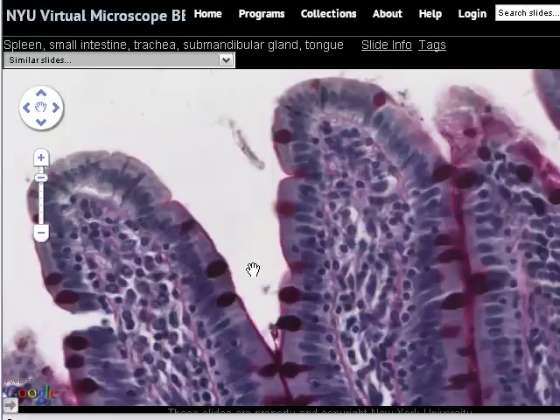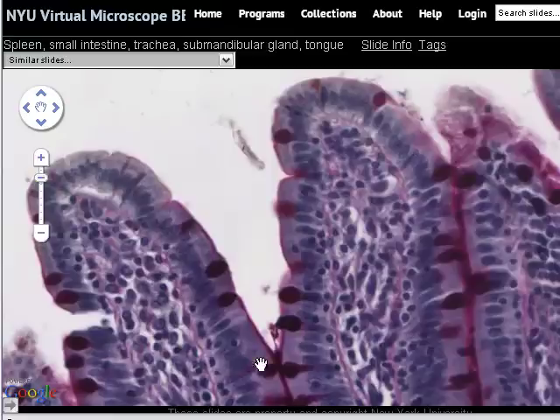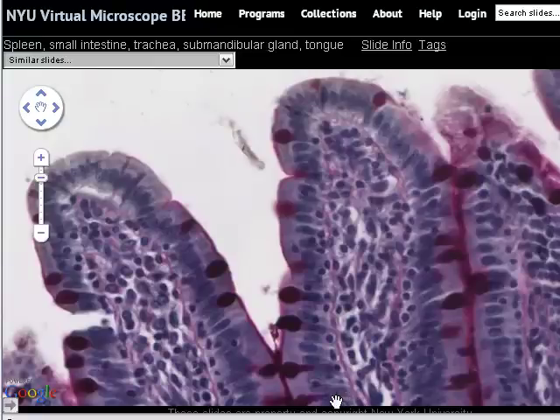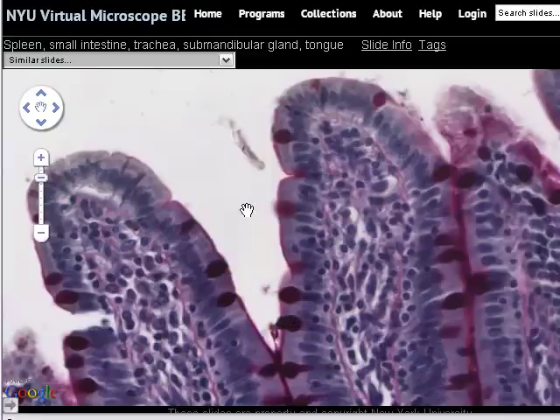There are actually two distinct types of cells that make up this epithelium: the plain simple columnar cells, which form the bulk, and then these cells with intense red staining, which are called goblet cells. Their role is to secrete mucus. They're called goblet cells because they're approximately the shape of a wine goblet, as you can see well with this one here, for example.